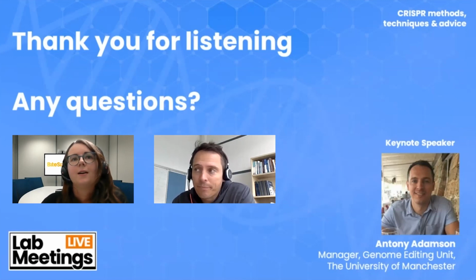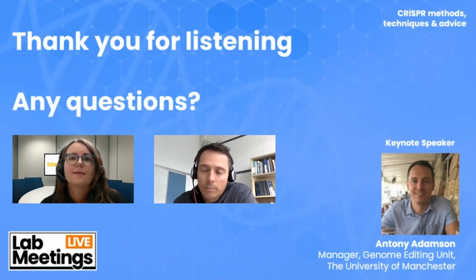Okay, thank you. And the question is from Adam Lynch. How can you check if your CRISPR-Cas9 knock-in has occurred on both alleles?